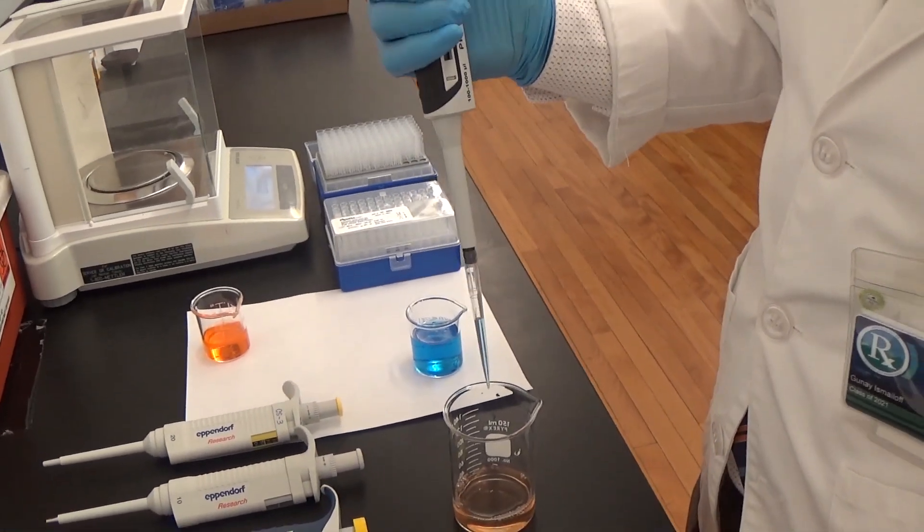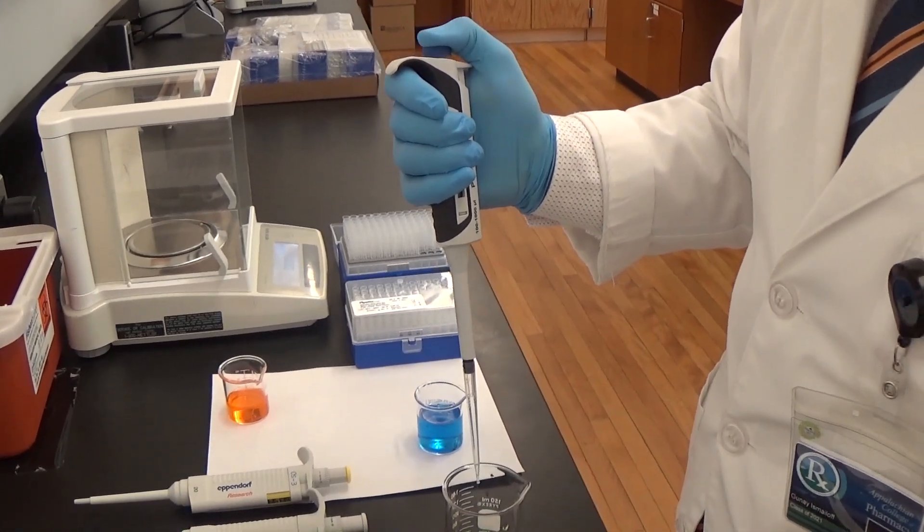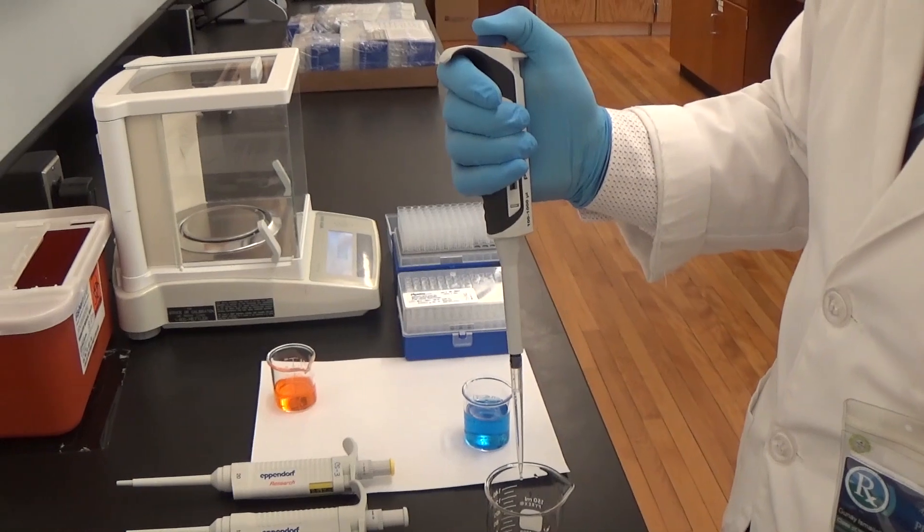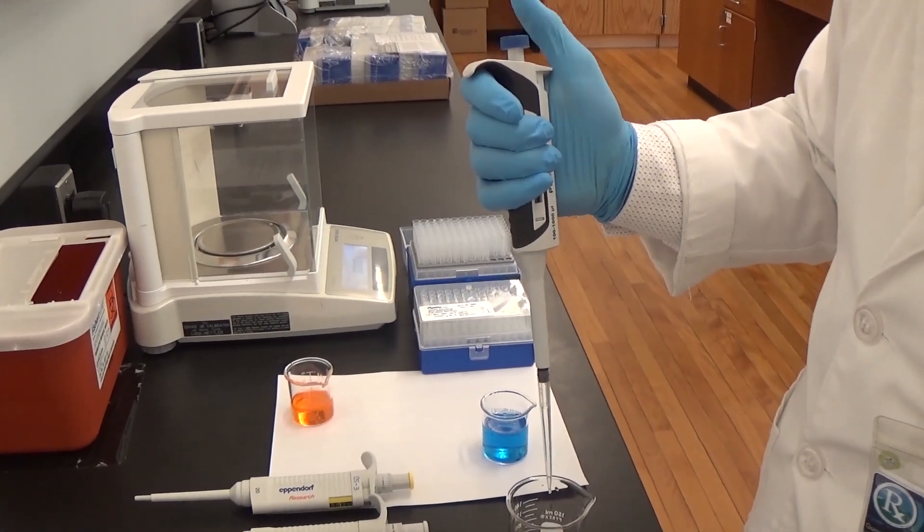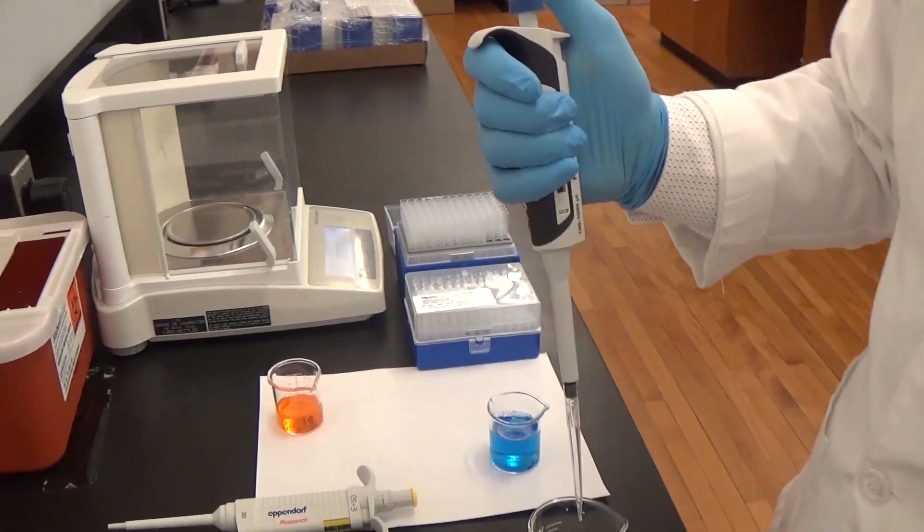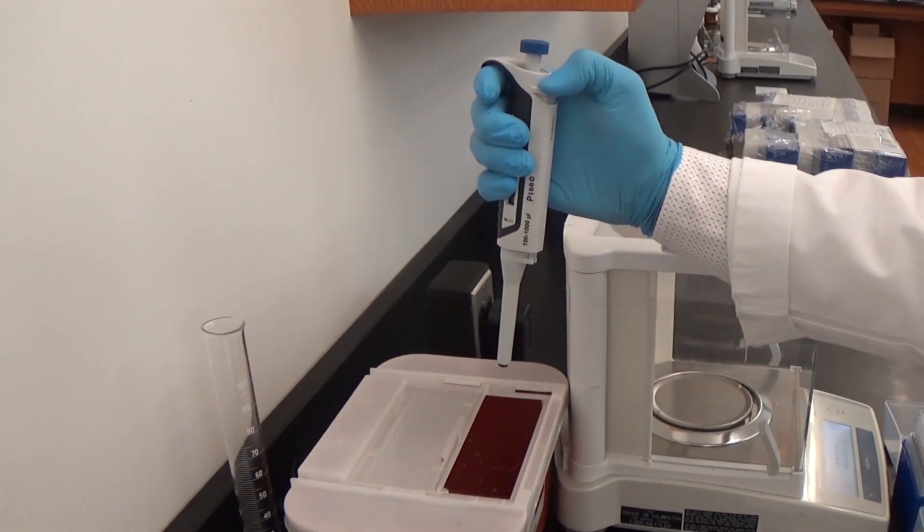Dispense the liquid by gently pressing down the plunger button to the first stop. After a short delay, press the button to the second stop to empty the tip completely. This will result in dispensing the correct volume of fluid. Tips should be discarded into the appropriate container.